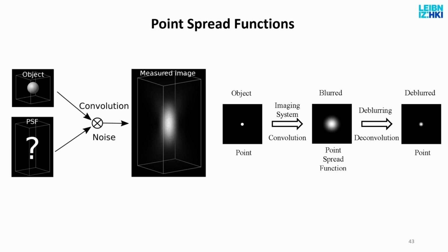Why is it elongated? It's elongated because of what I said: the Z resolution is about 3 times worse than the lateral. So when I image a small spherical object below optical resolution, what I see in the microscope is a blurred, cigar-shaped image. And that's not something you did wrong. This is the optics, the theory of optics behind it.